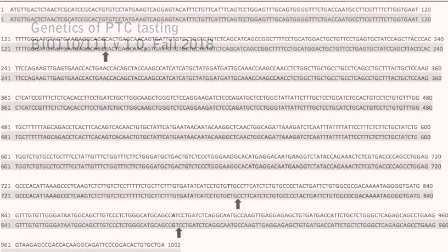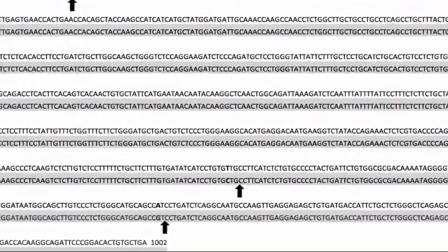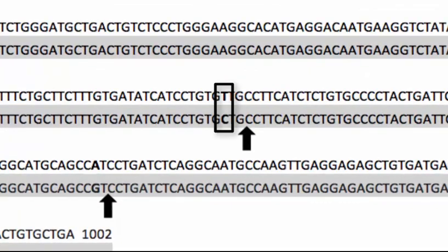Okay, now comes the practical part. The nucleotide that's there at any one of these three SNPs should be enough to tell you if you have one form of the gene or the other. What we're going to do in this lab is to collect our own DNA and focus precisely on the second of these SNPs. We're going to find out if it's either C for the taster allele or T for the non-taster. Think about this for a minute.